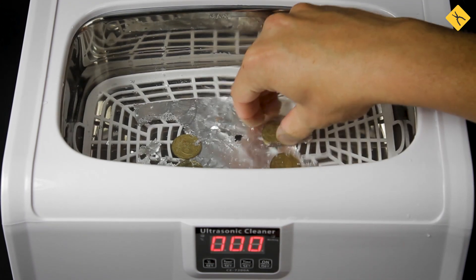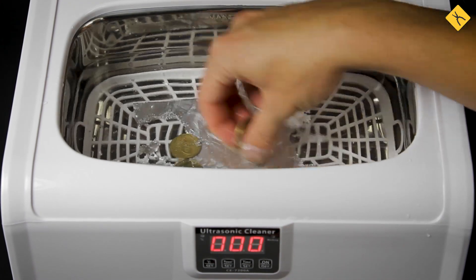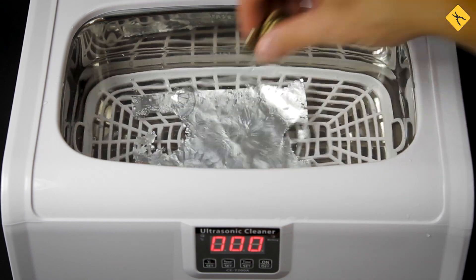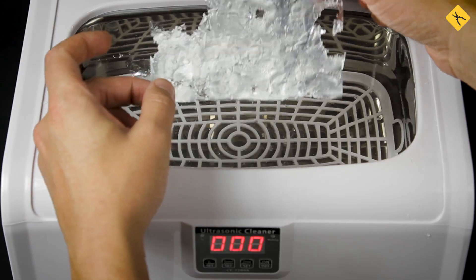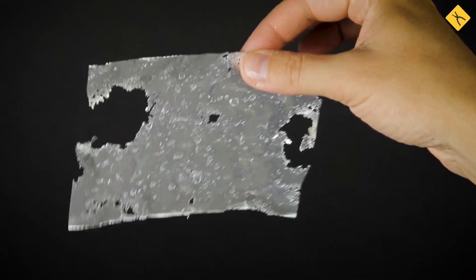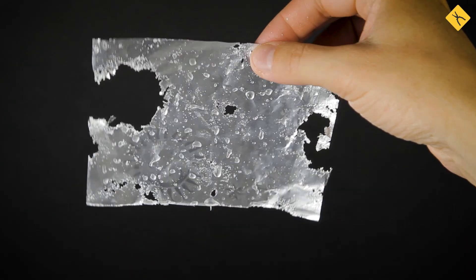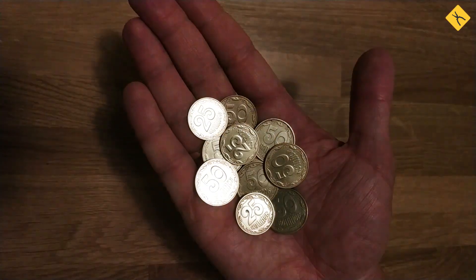Ultrasonic cleaner CE7200A has five selectable ultrasonic power modes. For other tests we've used the highest ultrasonic power mode. The test results indicate that our ultrasonic cleaner is performing well and will be able to cope with any sort of dirt.